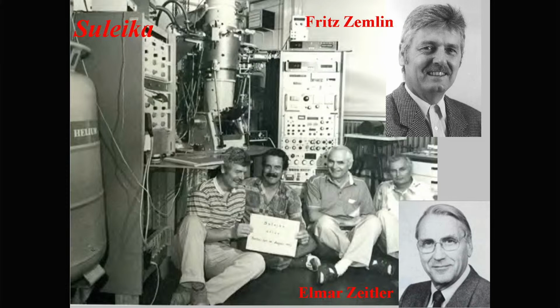Who hired me was Elmar Zeitler. And this is Fritz Zemlin, who was one of the developers of the highest resolution microscopes, certainly in the 1980s. And people would then come from all over to use his microscope. This is the last day of the Suleika, and they were transferring the Dietrich lens, which is a superconducting liquid helium lens, into a CM200 type of microscope.